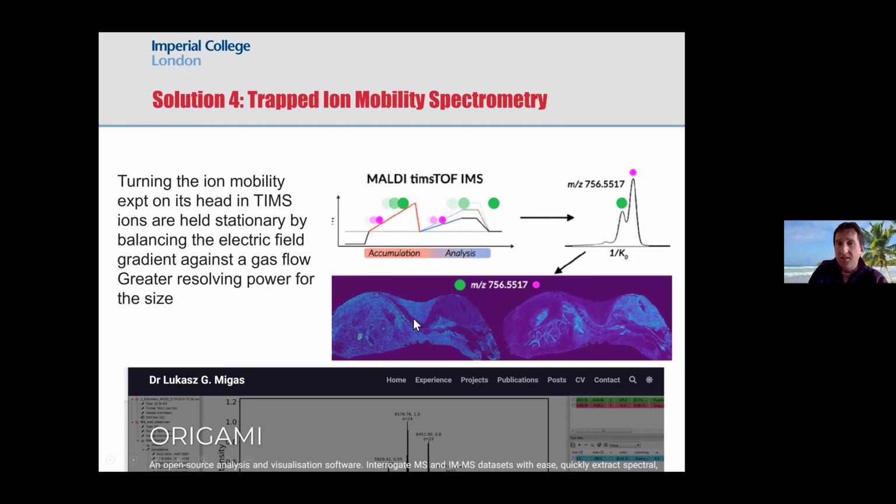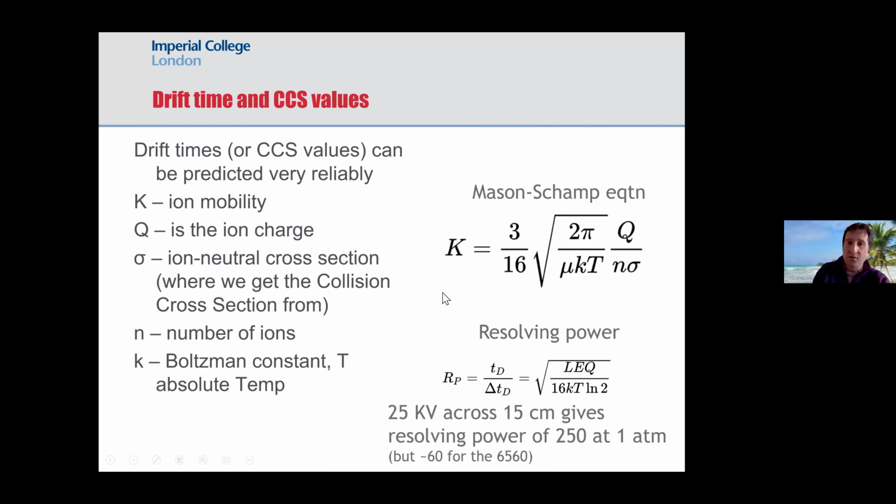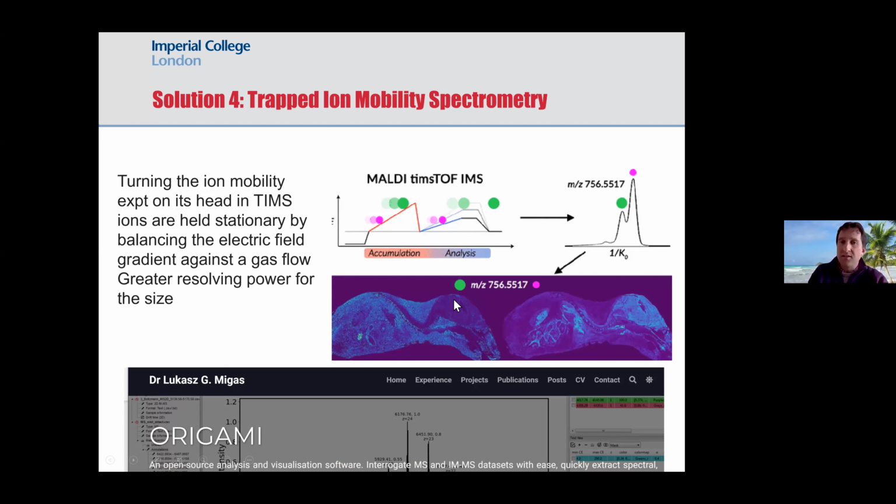And then the surprise is that our red ions over here have a really very different distribution to what we might expect to see in terms of our green ions, in terms of the image that we have over here. And we, of course, can't separate that out by mass spectrometry, but we can do a nice job in terms of the ion mobility overall.